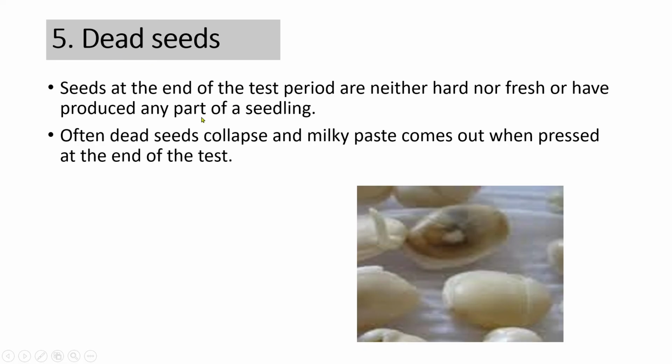Next is dead seeds. Seeds at the end of the test period that are neither hard nor fresh, and have not produced any part of the seedling. Often dead seeds collapse and a milky paste comes out when pressed at the end of the test.